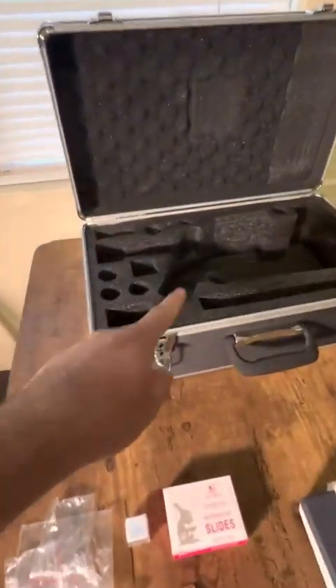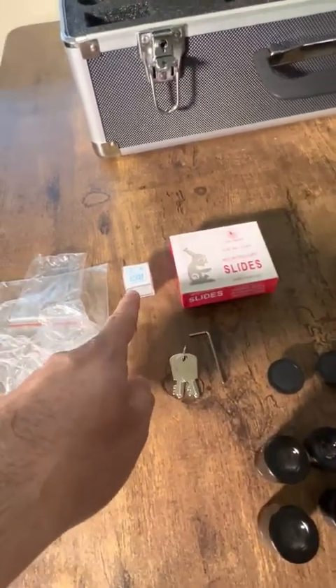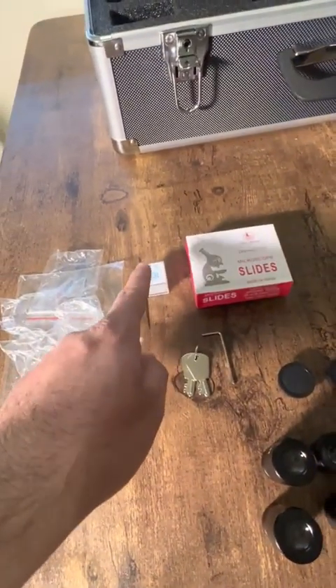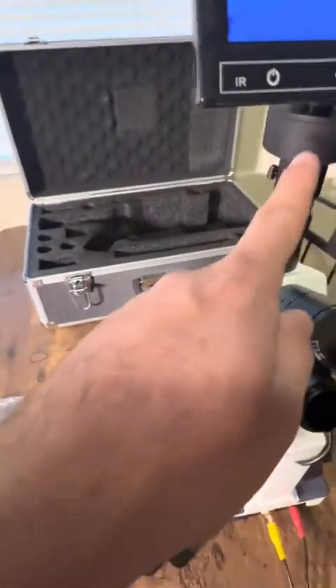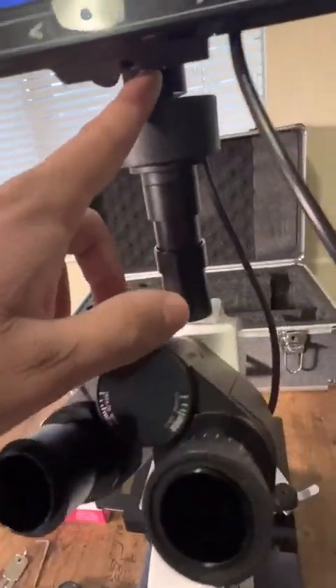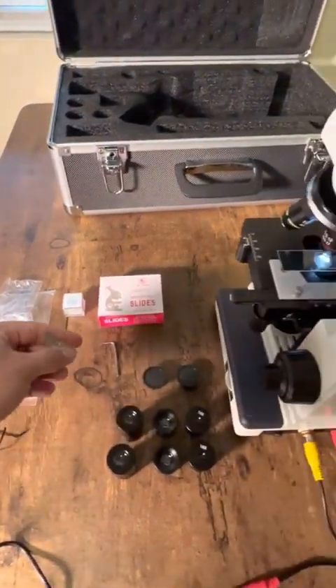It also comes with a case, 50 slides, and a hundred glass covers. An Allen key to adjust the actual mechanism for putting on the monitor, and then keys to lock it if you need it. So perfect for high school.